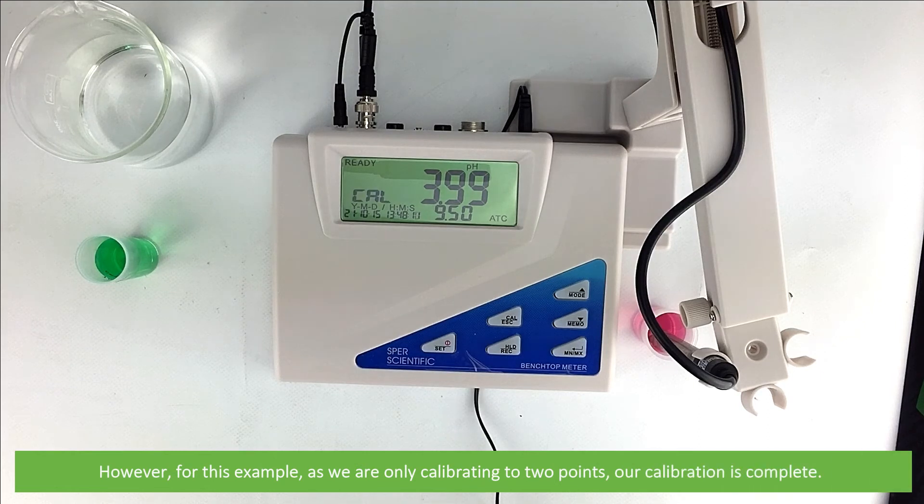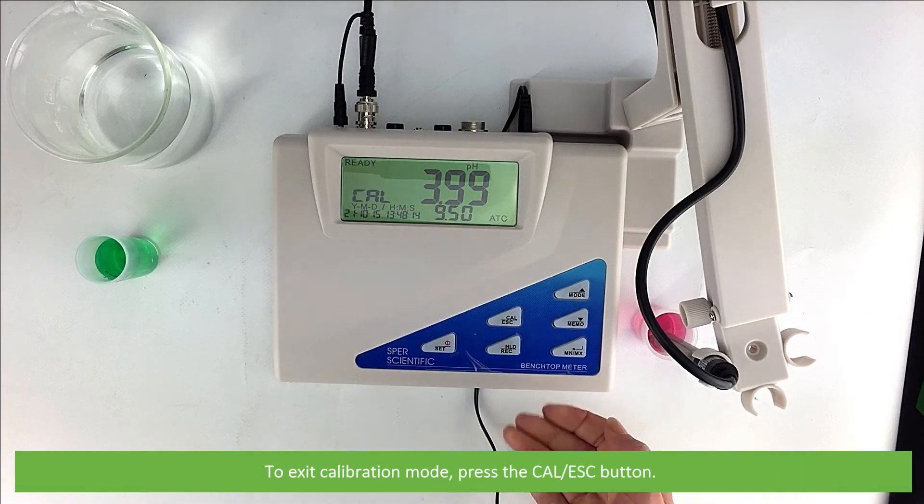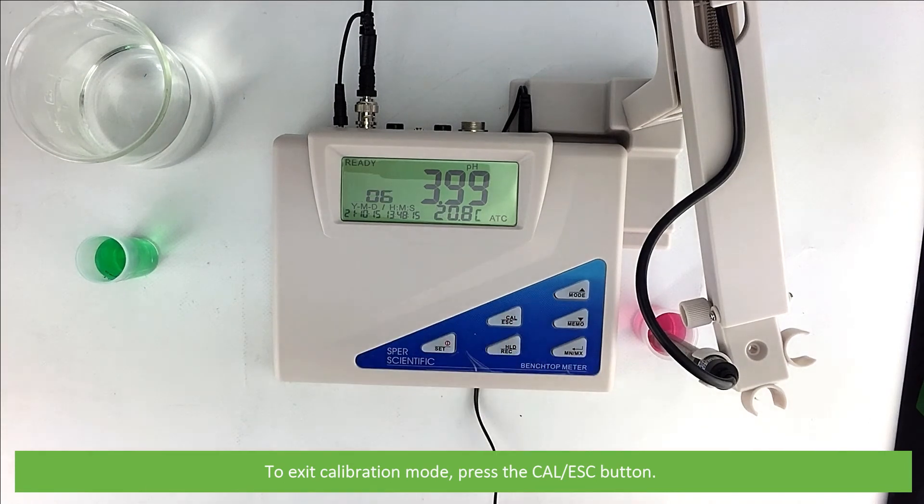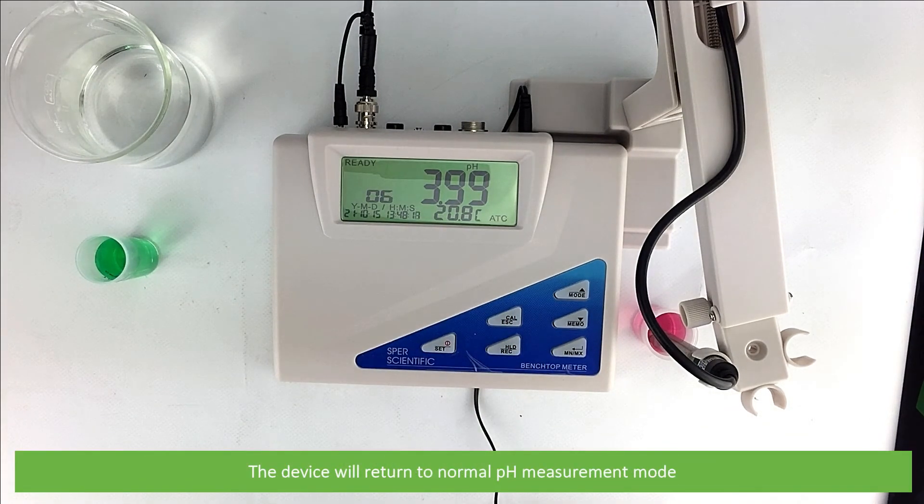However, for this example, as we are only calibrating to 2 points, our calibration is complete. To exit calibration mode, press the Cal Escape button. The device will return to normal pH measurement mode.